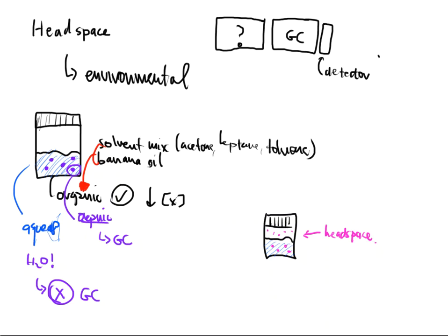So now the question that you should ask yourself is, okay, well, what if there's other components down in this water sample too? And let's say that these other components have higher boiling points. What if those boiling points were not at room temperature? Would those still stay in the liquid solution? And the answer to that question is yeah, they could.